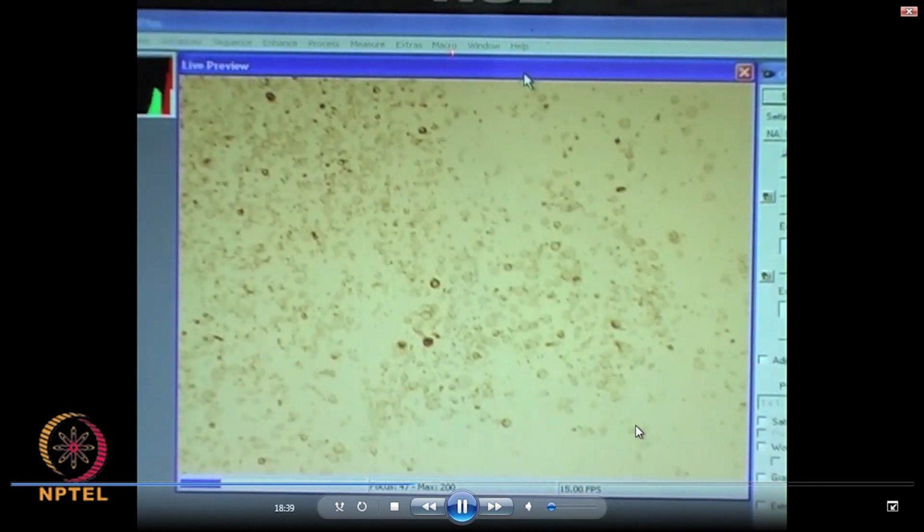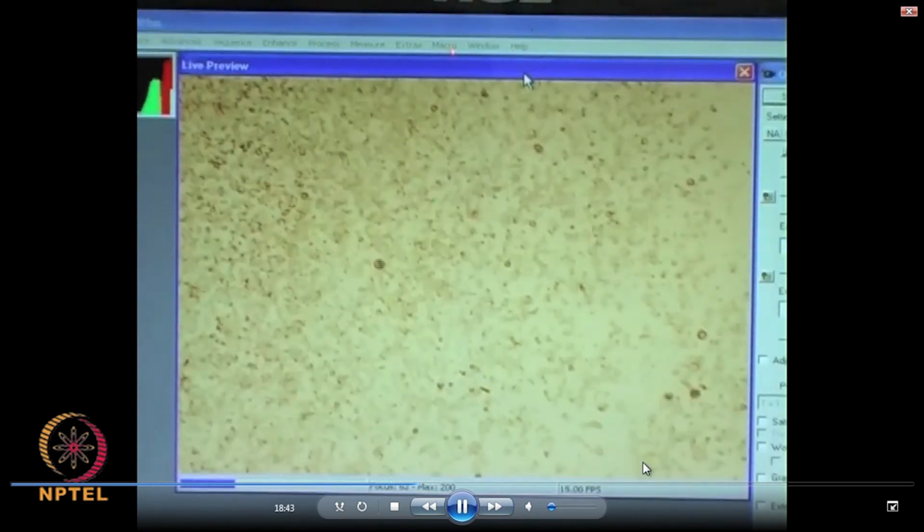You start looking at the details of these glass microspheres, and this is how it appears at very low magnification. As we increase the magnification, you will slowly see the minute details. Right now the specimen is being focused in the best possible manner.